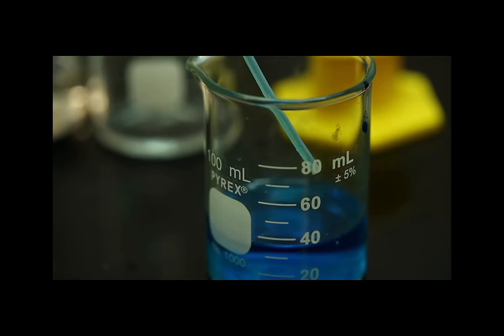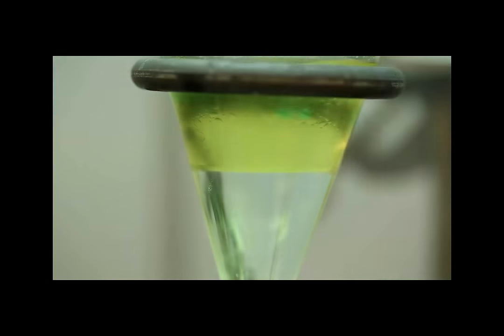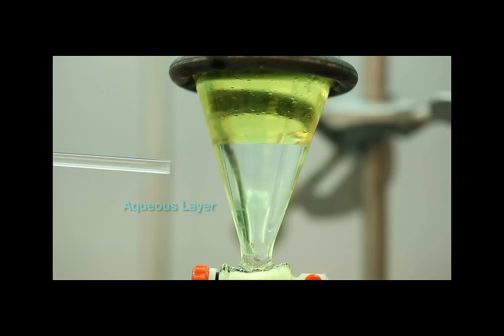To verify the identification of the layers, you can perform a water drop test. Using a dropper, add a few drops of water to the funnel, and observe which layer the droplets mix into. As expected, the heavier layer is on the bottom, leaving this as our aqueous. In this case, this is our organic layer.